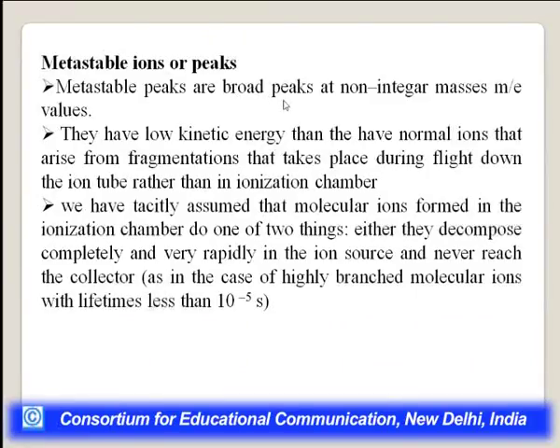Now another important topic: what are metastable ions or metastable peaks? Metastable peaks are comparatively broad peaks. They are not sharp peaks. You must remember that these are observed at non-integer masses.